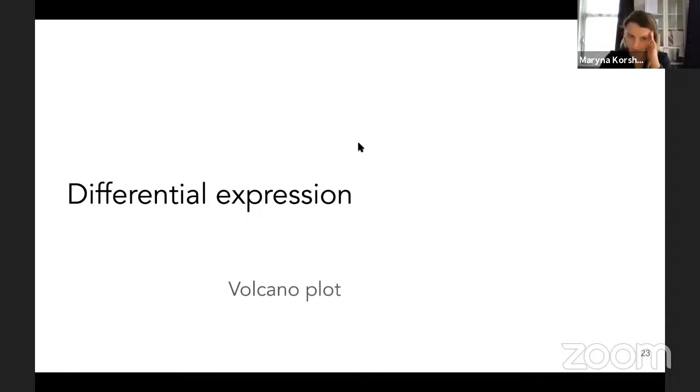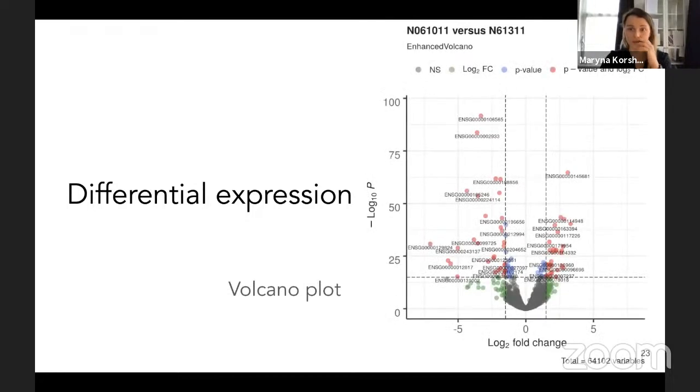But let's talk about differential gene expression. Here you can see these marker genes and visualize them using different metrics. You look into differentially expressed genes in one particular sample and can recognize genes which are highly or lowly expressed compared to other cell types. Actually, as marker genes, the abundance of one transcript is a biomarker, but the absence of particular mRNAs is also a biomarker.